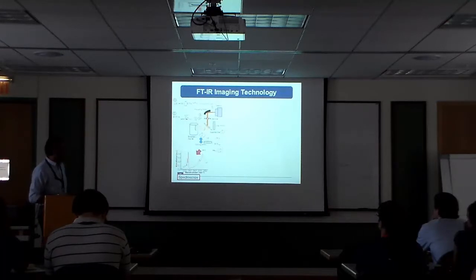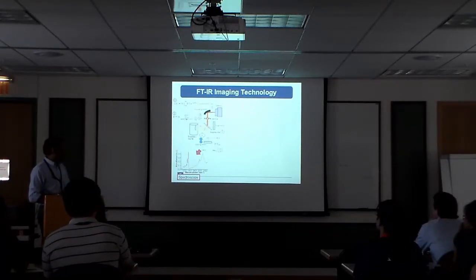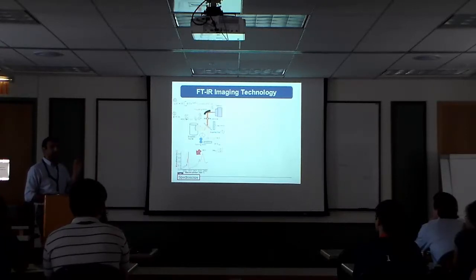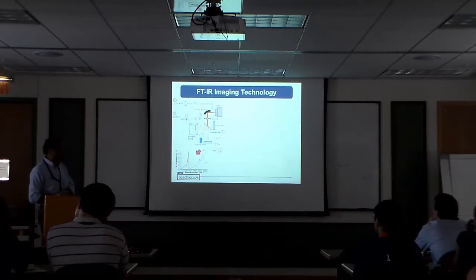Our system pretty much used to look like this. There are multiple implementations, and perhaps you've taken a tour of my labs and seen some of them. But classically, the way this work has been done is you take a broadband source. This is just a heated wire, right? It's nothing else. You heat it so it emits light. It comes out, and we couple it to a Michelson interferometer. Notice that this is a completely symmetric Michelson interferometer. We don't actually put the sample in the reference arm like in OCT, for example.